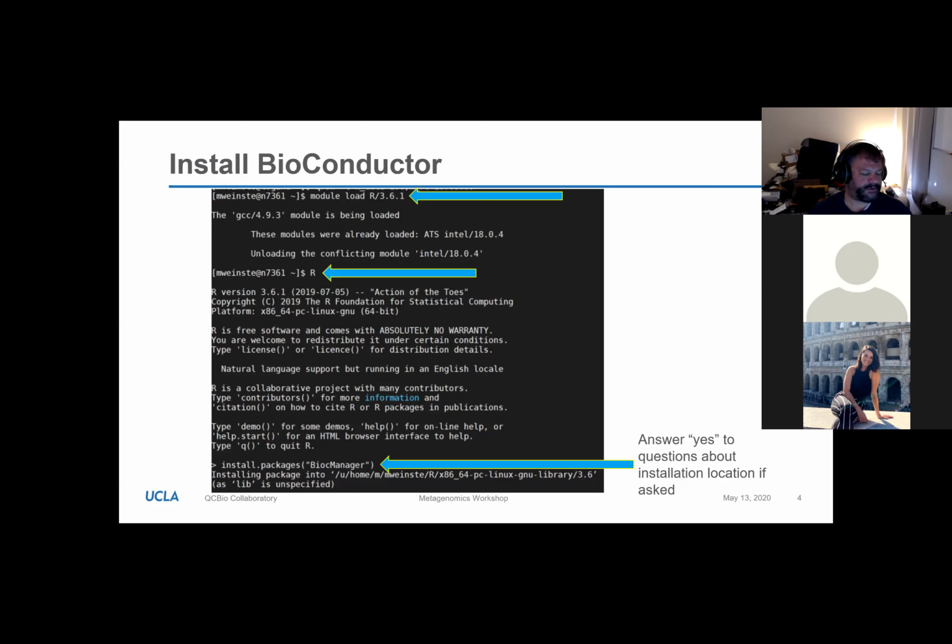All right, and if I remember correctly, this process just took me a minute or two. So module load should be just about instant. Running R, I sincerely hope nobody made mistakes with this command because it's literally just a capital R. And then the last command we're going to do is install.packages and this BiocManager. So this is going to install Bioconductor. This one can take a minute or two to run.